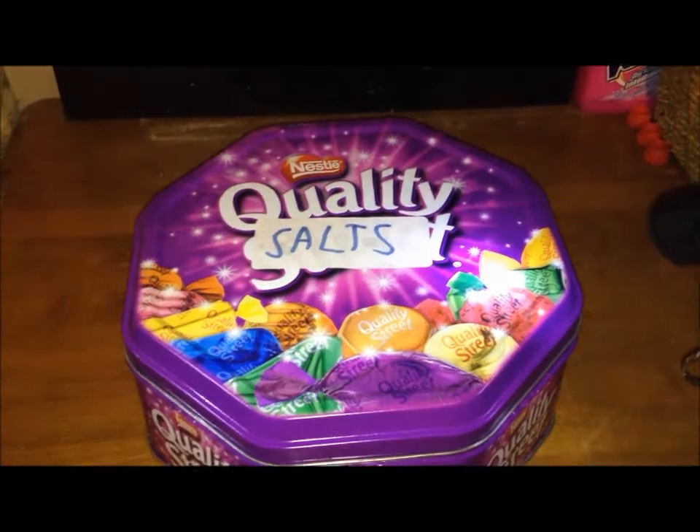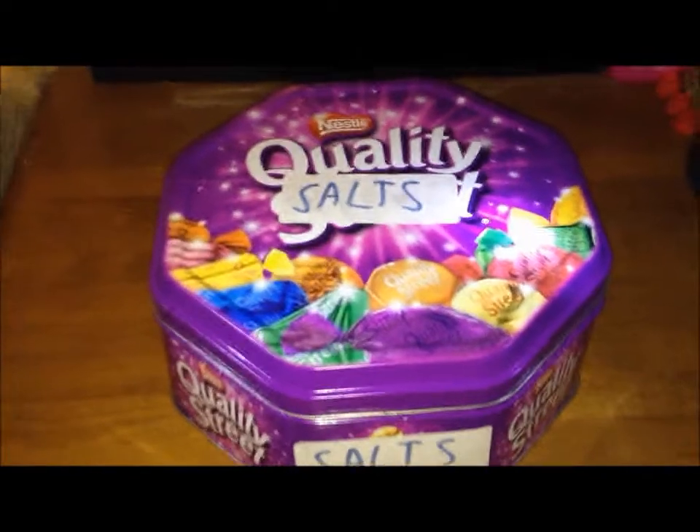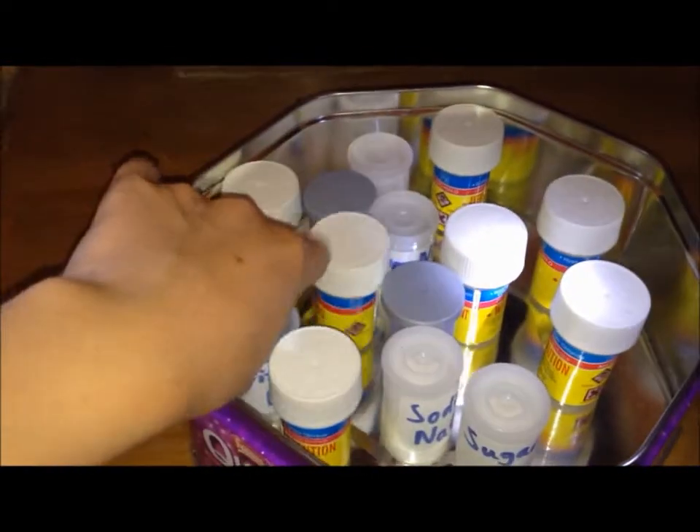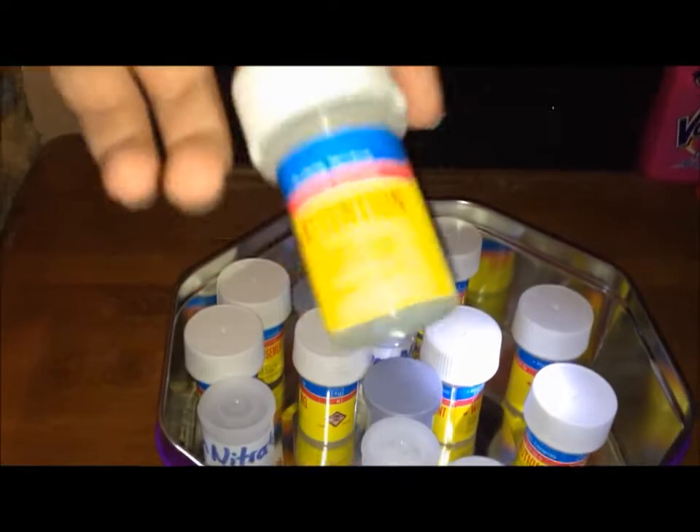Moving on to the final thing I keep in my big box: the salts. In here we have sodium nitrate — 10 grams of it, I made it myself. Iron(II) sulphate, which is a lovely green colour. Sodium chloride, just ordinary table salt. Sugar.